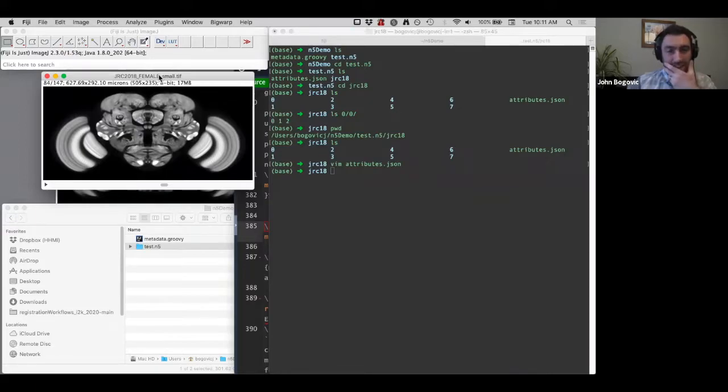So a nice thing about these plugins, and I mean the libraries behind them, and actually the formats themselves, is that they're all pretty similar. They all store data in these chunks, and the details of how those chunks are stored change in small ways, but not in serious ways.